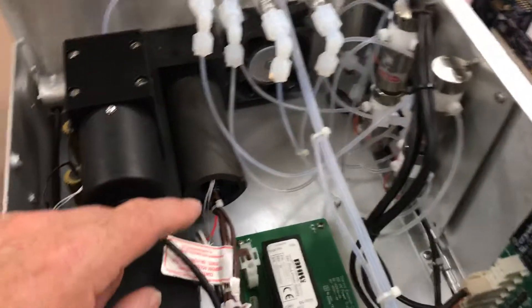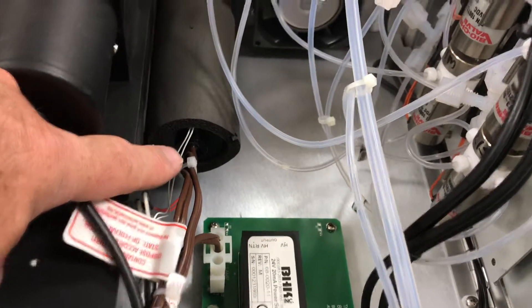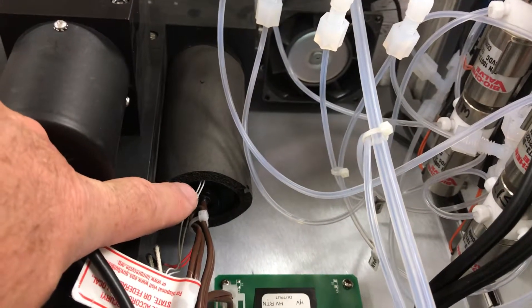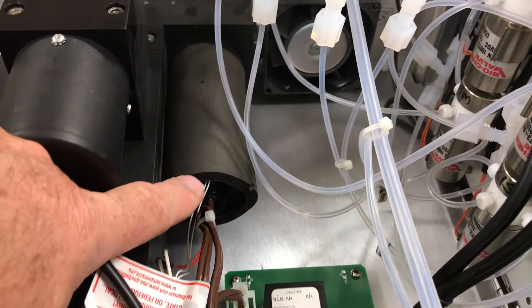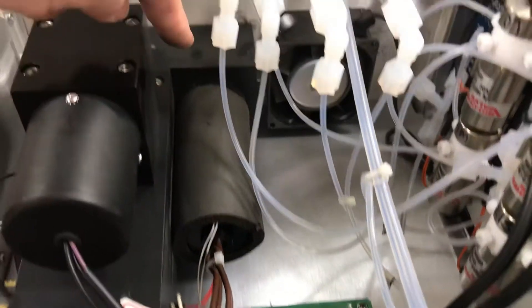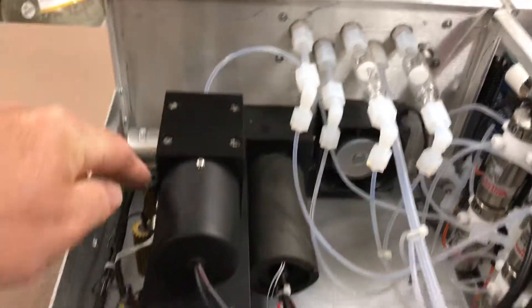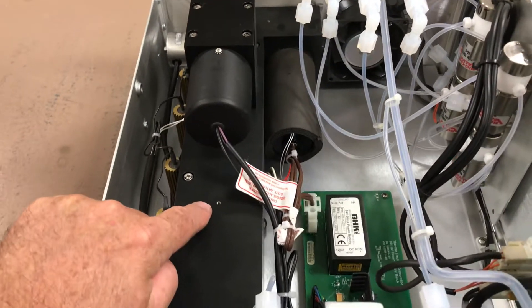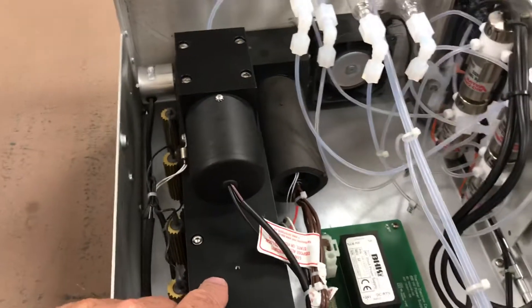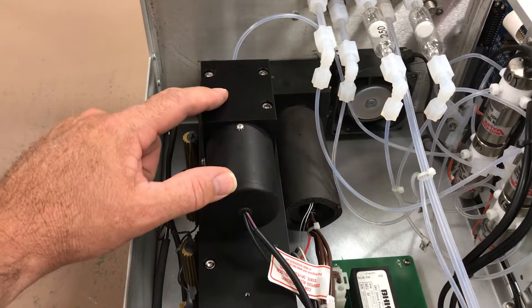It has an ultraviolet UV light source — a lamp that sits inside here. It's a constant source, not pulsed or chopped, just a constant UV light source shining into the bench. There are mirrors in the bench that direct the light source into the reaction cell. It's an absorption of UV light by the mercury vapor, and that's how it's detected by the photomultiplier tube that sits on top.